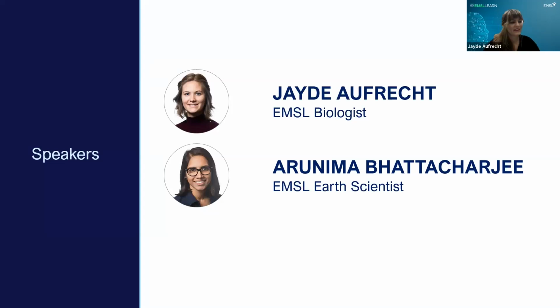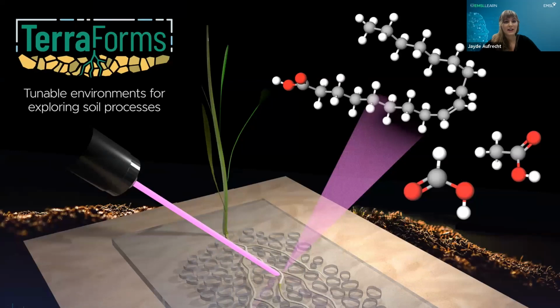Thanks, Genoa. All right, my name is Jayde. I'm a biologist here at EMSL, and I'll be kicking off the first part of our webinar today on our new capability called TerraForms. These are tunable environments for exploring soil processes. And so we'll be going through a few examples of these TerraForms and how you can use them for your own science.